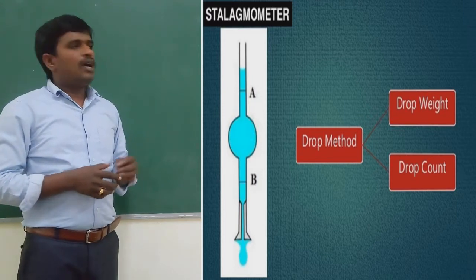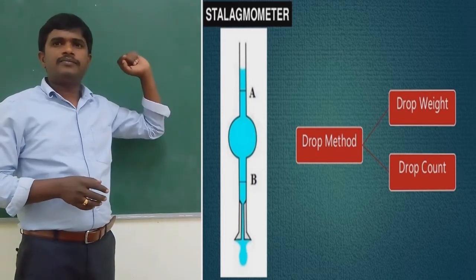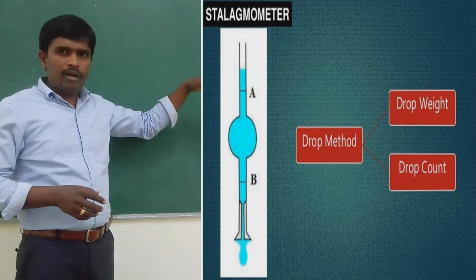This is the upper mark. In the center is a bulb.